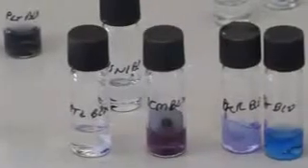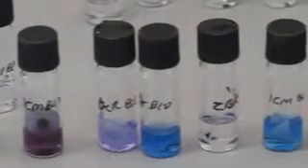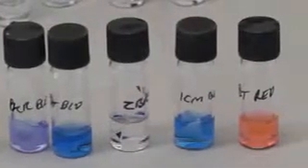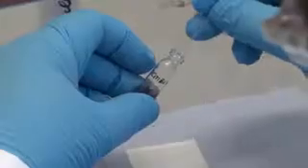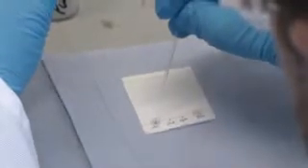That is, they all use dyes to give the ink colour. These dyes are powders that dissolve in solvents, and are therefore called soluble dyes. Because of their solubility, these inks can be tested using a technique called chromatography, where a sample of ink can be separated into its different dye components.